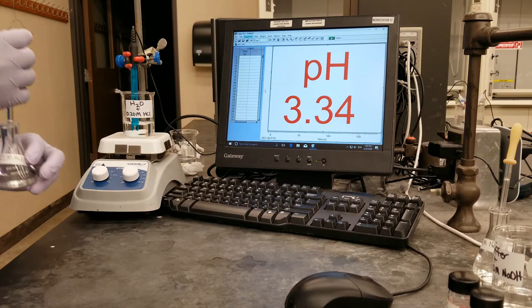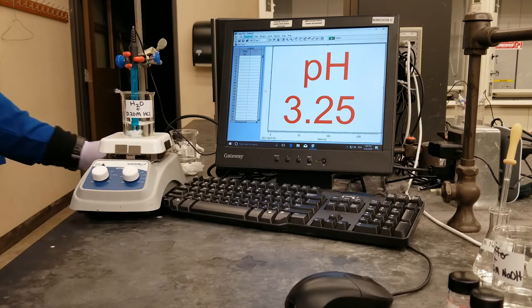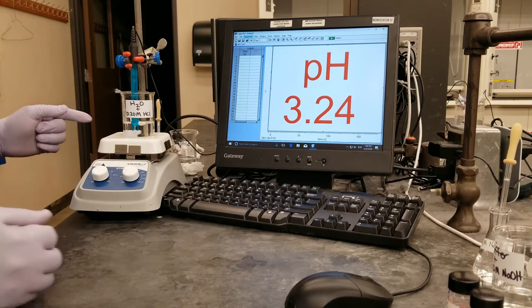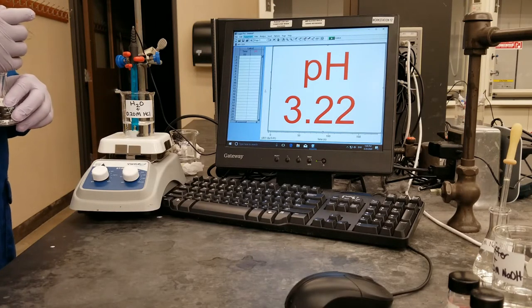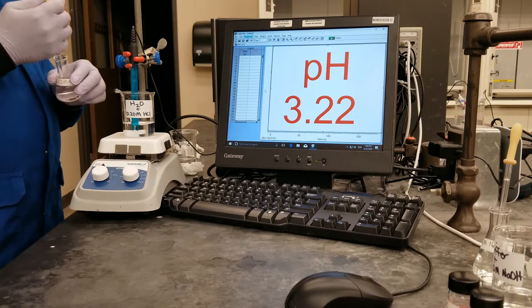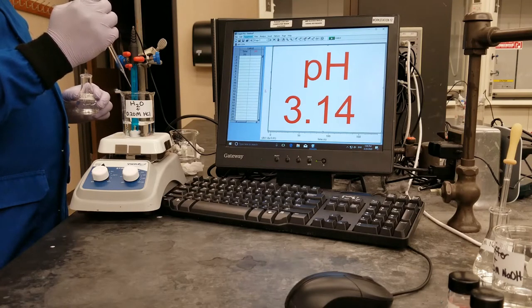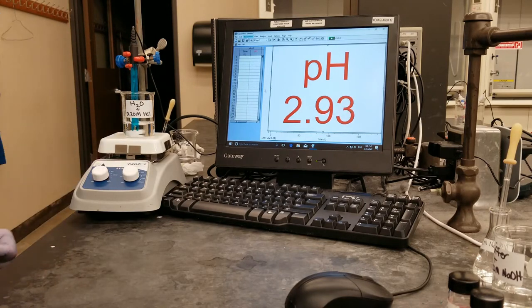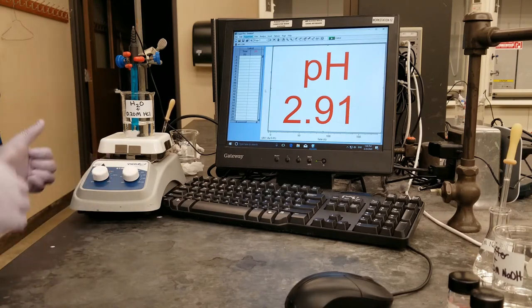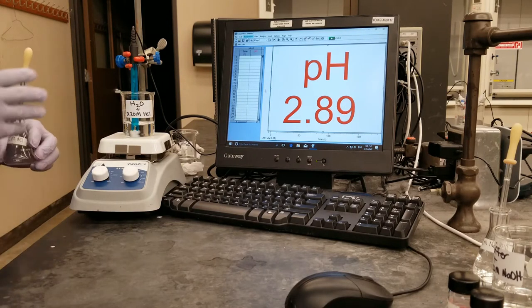So I have added the 10 drops of hydrochloric acid to the solution. With it thoroughly mixed, the pH is 3.23. I will go ahead to add the next 10 drops, and we will wait for the pH probe to stabilize. And that gives us a pH of 2.89.